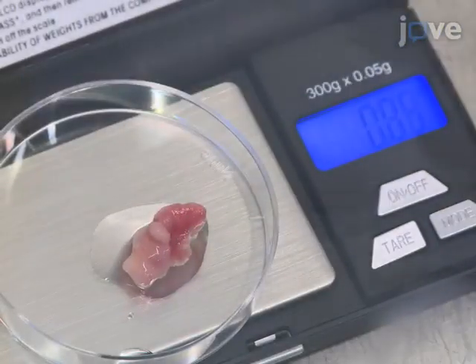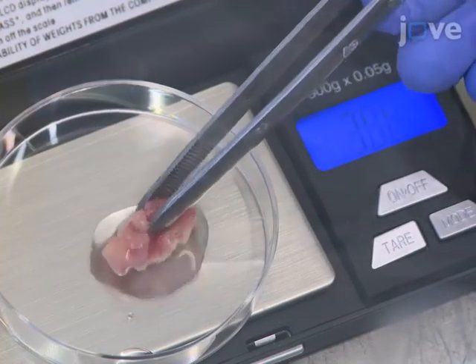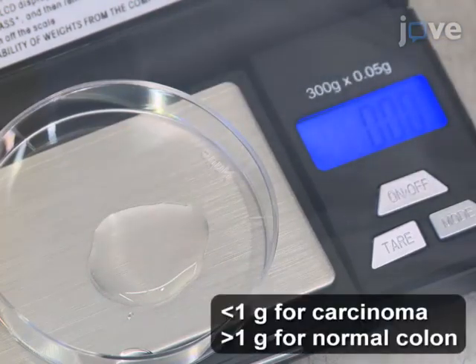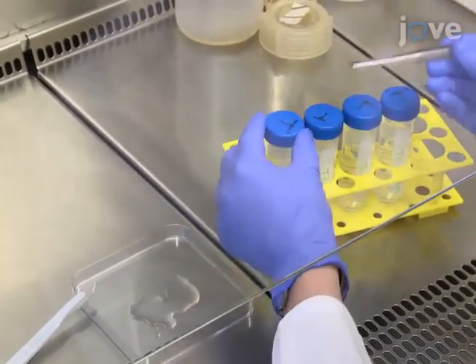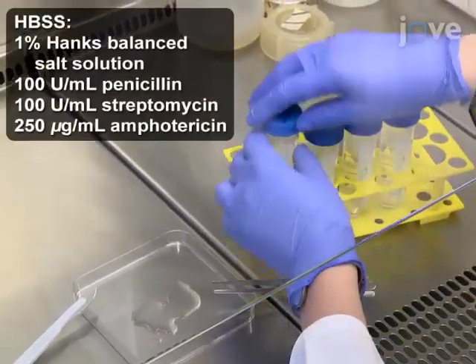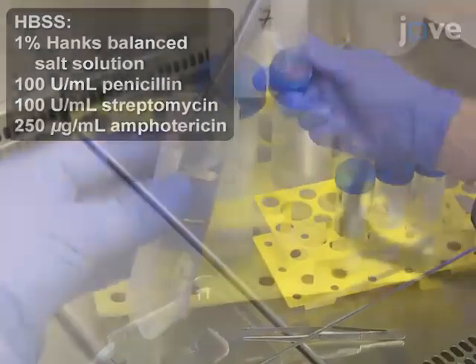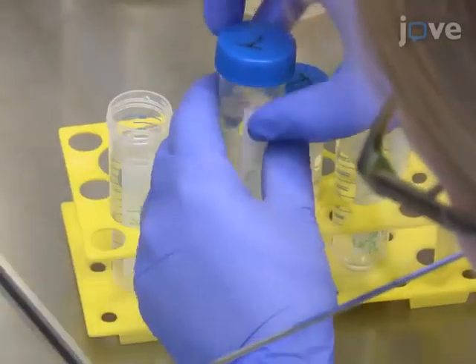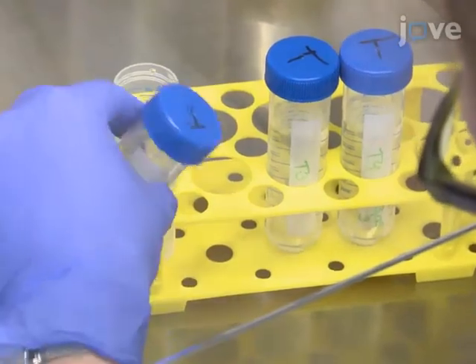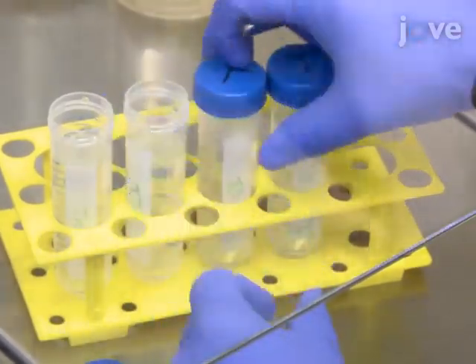To obtain the tissue specimen from colorectal carcinoma patients, use a fresh scalpel to obtain pieces of tissue which weigh about a gram. Then use sterile forceps to transfer the fresh tissue pieces in 40 milliliters of ice-cold HBSS buffer with antibiotics in a 50 milliliter centrifuge tube. Then use separate sterile forceps to transfer the carcinoma and the normal tissue sequentially from one centrifuge tube to another to wash in 40 milliliters of ice-cold HBSS buffer with antibiotics four times.